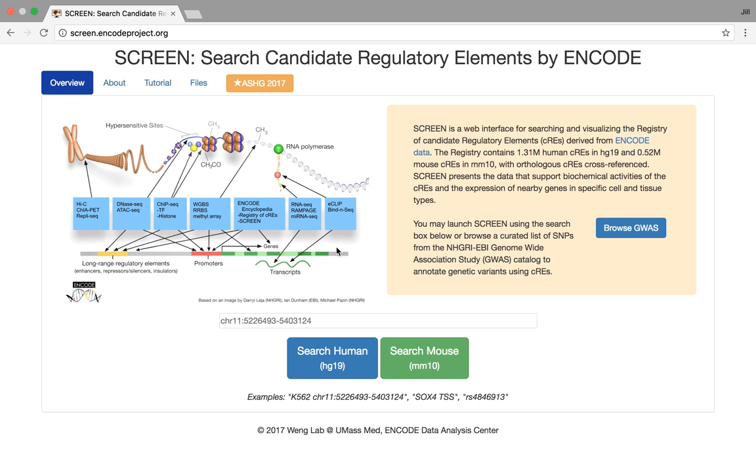So we have these millions of candidate regulatory elements, and unless you're using the command line in Linux to sort through them, it's very difficult to actually manipulate them. So we needed this visualizer that we've called SCREEN, Search Candidate Regulatory Elements by ENCODE.